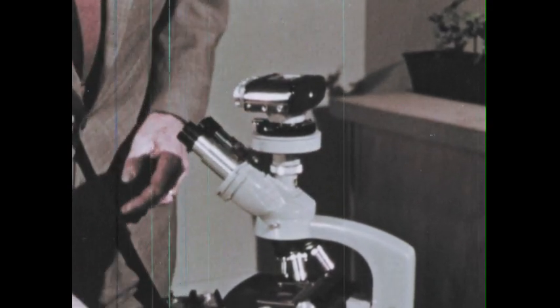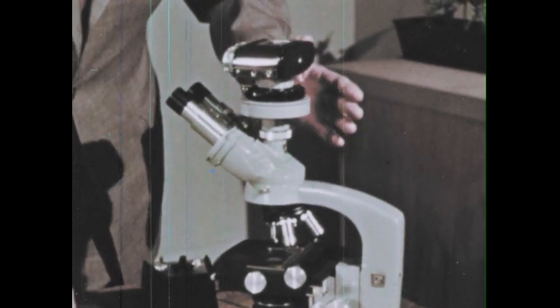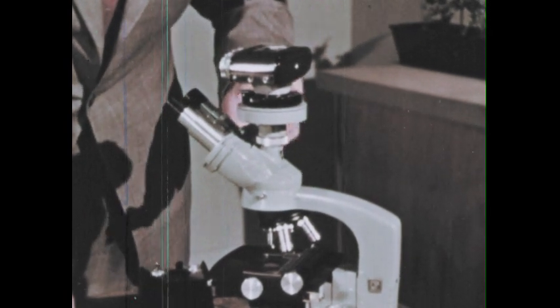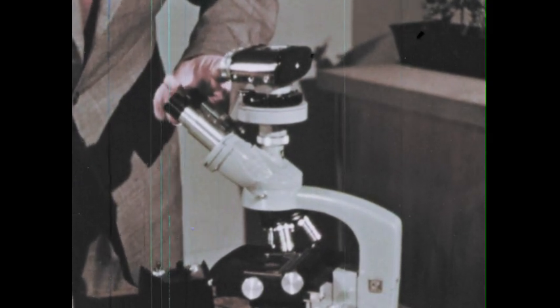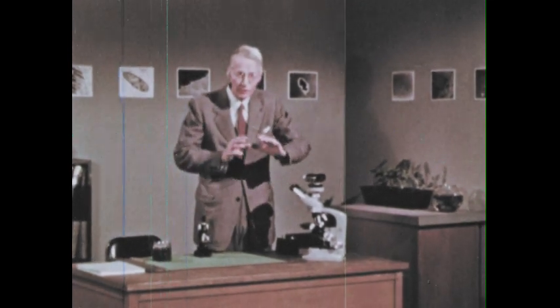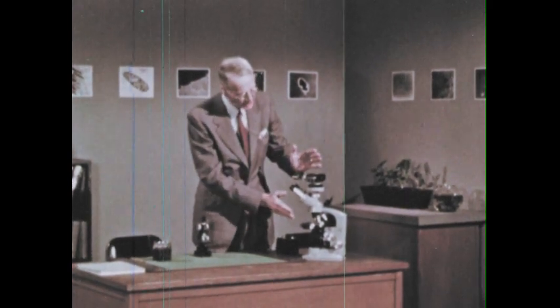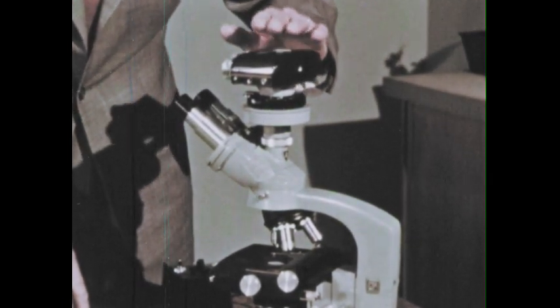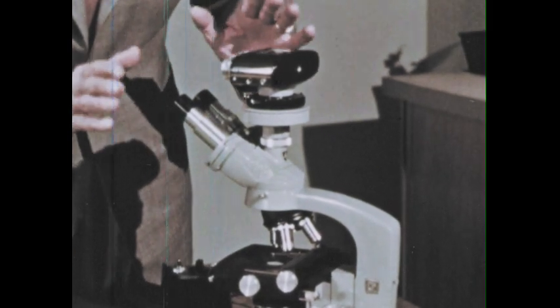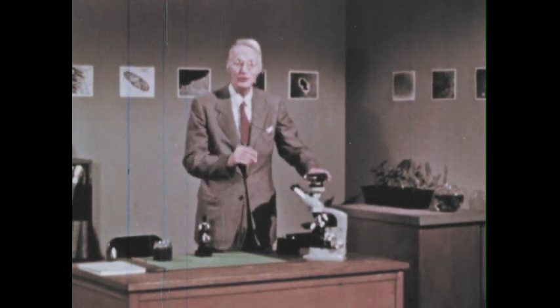It's very steady — as you move the focusing or do any other adjustments, it doesn't jiggle. You can move them with the greatest delicacy and accuracy. The lenses are about as perfect as you can get. And you can change the light so it looks deep into the interior of things, or so the background is dark and the thing itself is brilliantly lit. Doing all these things, you can watch with your eyes or place here a motion picture camera, and so we can record on film all the interesting things that you want to see. So we have done that. Let us look at that film.